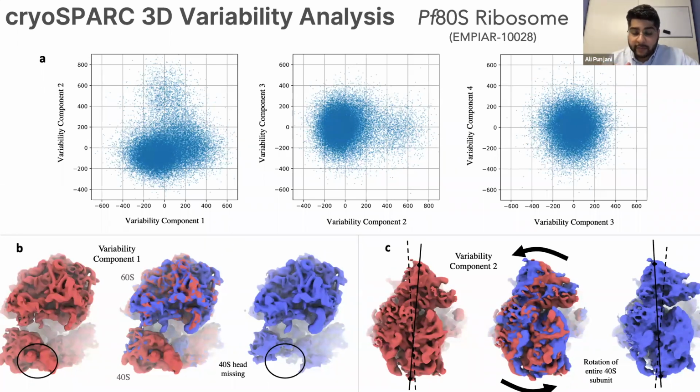And if my understanding is correct for the statistical physics side of it, the molecule itself has an energy landscape that, if it's not a perfectly rigid molecule, is somewhat shallow. There are multiple different shapes or conformations, positions of all the atoms, that are energetically not too far apart. And at a certain temperature, like at room temperature before freezing, the particle can randomly, just by Brownian motion, sample that set of energetic positions or low enough energy positions. And then it gets frozen into one of those positions.